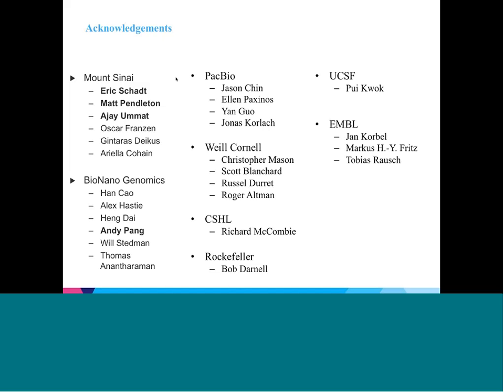That's right. I think both technologies have tremendous advantages, and the way we did it is currently one of the best. We believe that, obviously; we wouldn't have done it this way if we didn't think it was one of the better ways of doing it, because you really get that minimal contig size. As you can see from those other short read approaches, you're getting very small contig sizes, even if you have high scaffold sizes. And those small contig sizes don't do as well when combined with the genome maps. You really want slightly larger contig sizes. But yes, we could probably get away with having a 500 kb N50 and get pretty similar results as opposed to a megabase or 5 megabases.